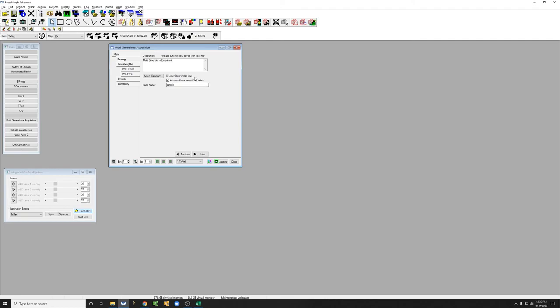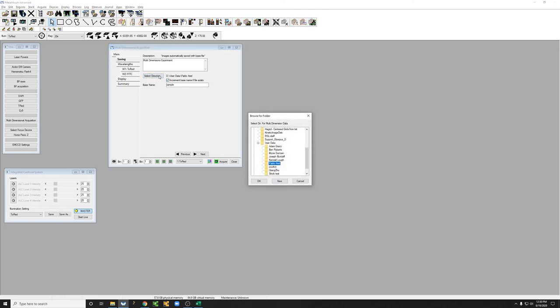Note that it's actually a good idea, if possible, to select a directory with the date on the particular day that you're doing the experiment, just to organize your files better. I'm going to go back here, expand my folder, and select a subfolder that I made with today's date.